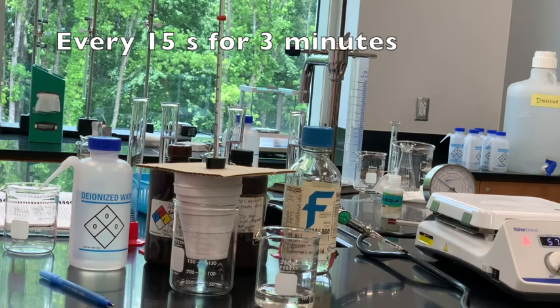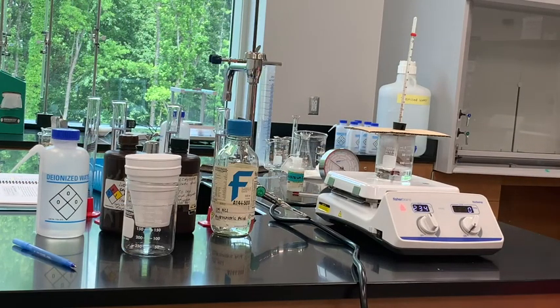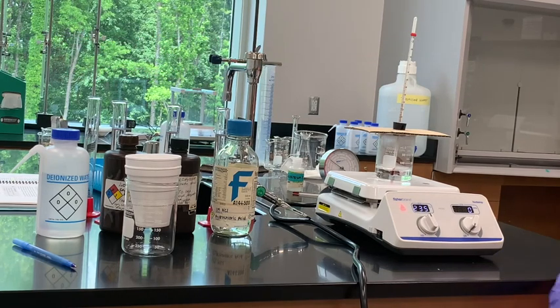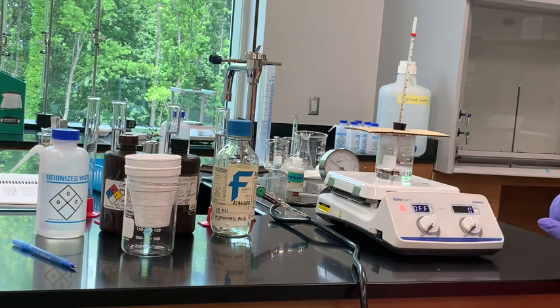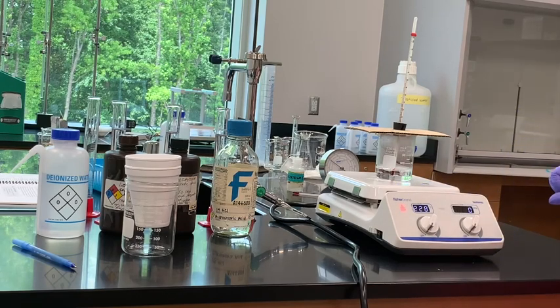We're going to monitor the temperature every 30 seconds for three minutes. When I pour the water into the calorimeter, I need to be ready to start timing and take the temperature every 30 seconds. Make sure you have something to write with, someone to time, and someone watching the thermometer so you're prepared. You don't want to pour it in, let it sit for a few minutes, and then start taking temperatures — that won't work well. Right before I pour it into the calorimeter, I'll note the temperature of the warmer water.